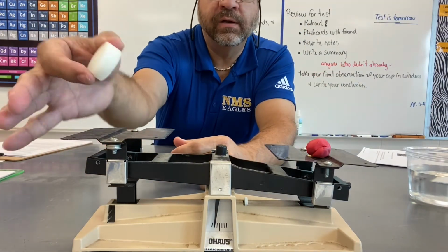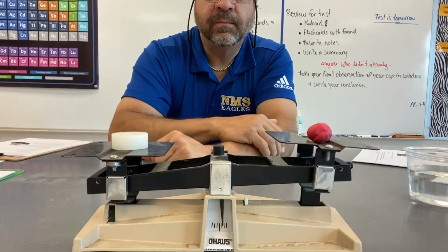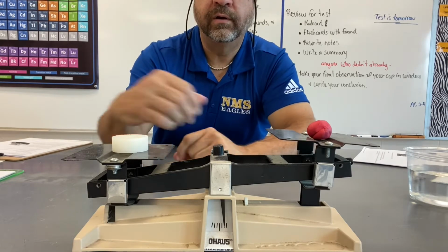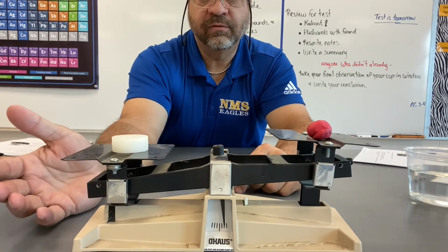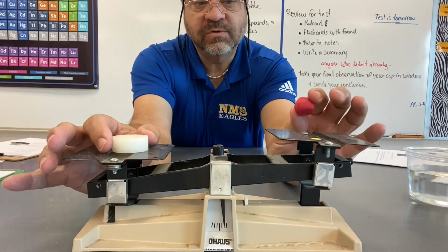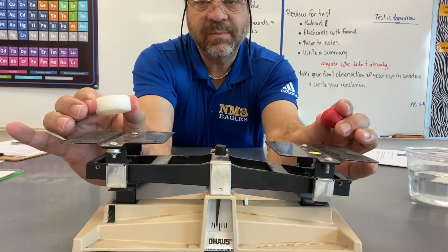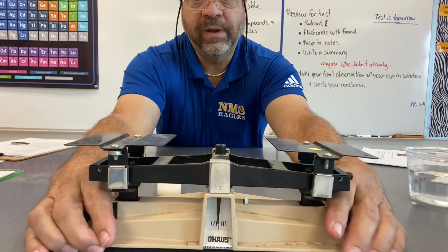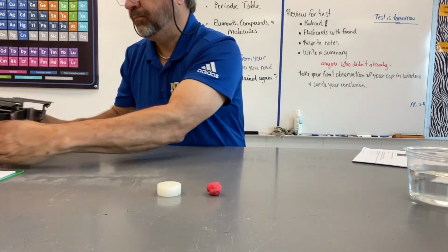All right, so here comes the tea light candle. All right, think about that. Which one is actually heavier? All right, so hopefully you said that the wax is heavier, which I found a little bit surprising. The clay seems very dense, and the wax doesn't seem as dense, but the tea light candle was heavier because it weighed down one half of the balance.